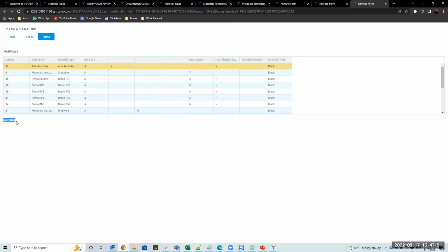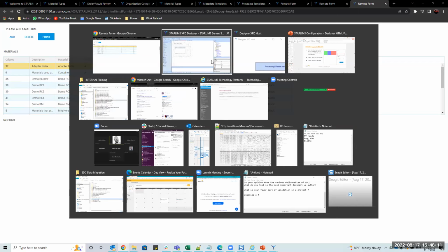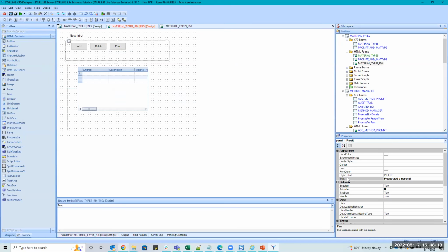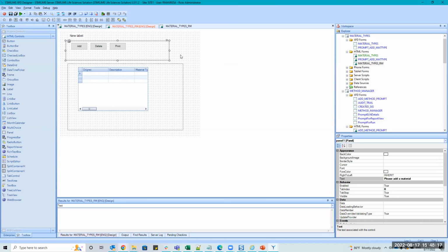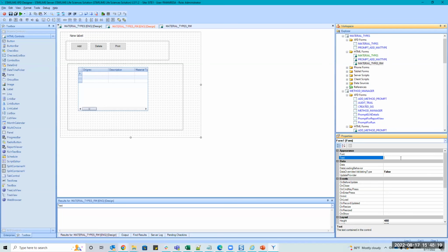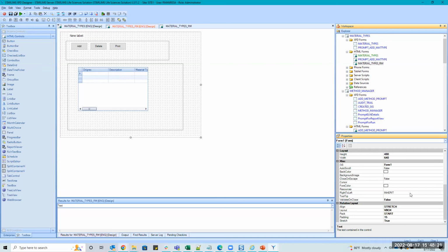I've seen it where the font is like bolded. But again, for consistency, like I mentioned at the beginning, right? So it's all uppercase. So people are gonna get a consistent UI, right? If not, somebody's gonna write it like this or capitalize the L. So I mentioned that at the beginning. I usually like the text properties, definitely of grids, and then panels. The form, yeah, this would just be the name of the form.